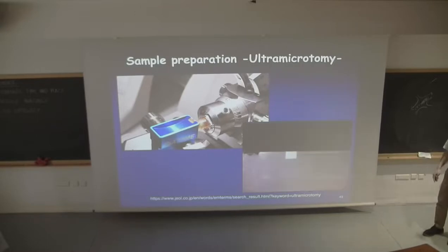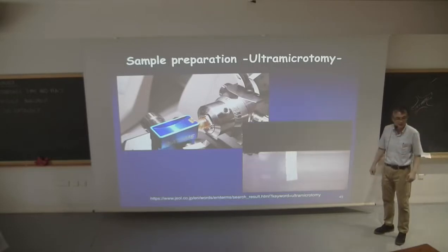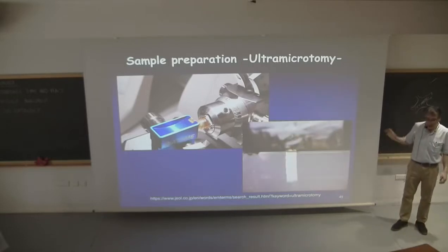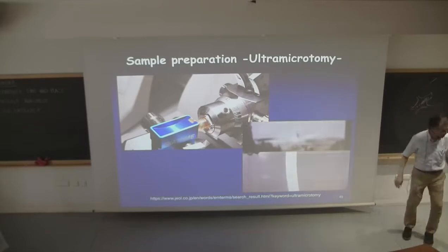One section, second section, third section. So you can keep going. That's how we make a very thin layer of the sample, okay? And you have a question? Okay, how do I pick it up?